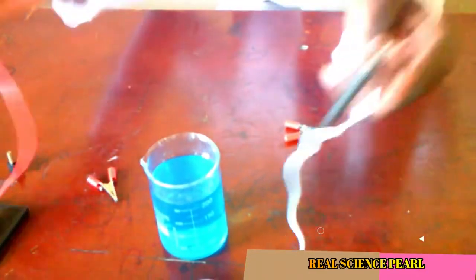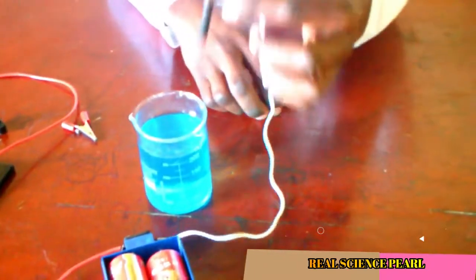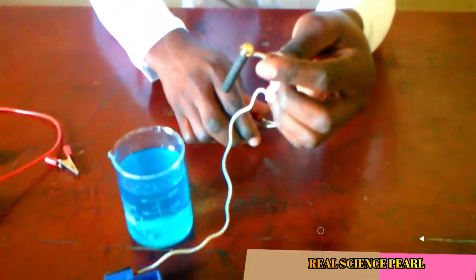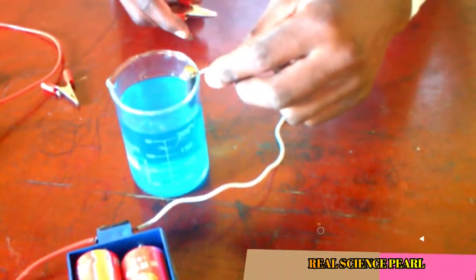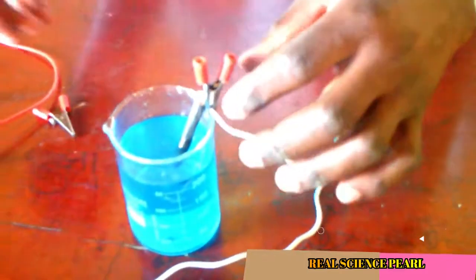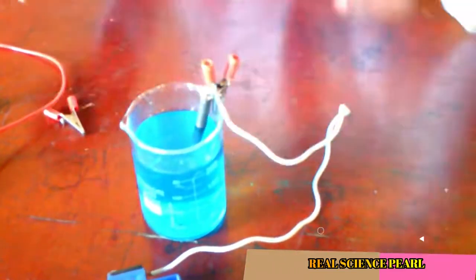Let's go. So here with me I have the graphite electrodes extracted from the dry cells, perhaps those ones which are old, and they are going to work as the anode and the cathode. This one I'm holding right here, and I'm going to dip them into my copper sulphate solution, and I'm going to use a crocodile clip to grab it next to the beaker. Then like this, I'm going to fix it to be firm.